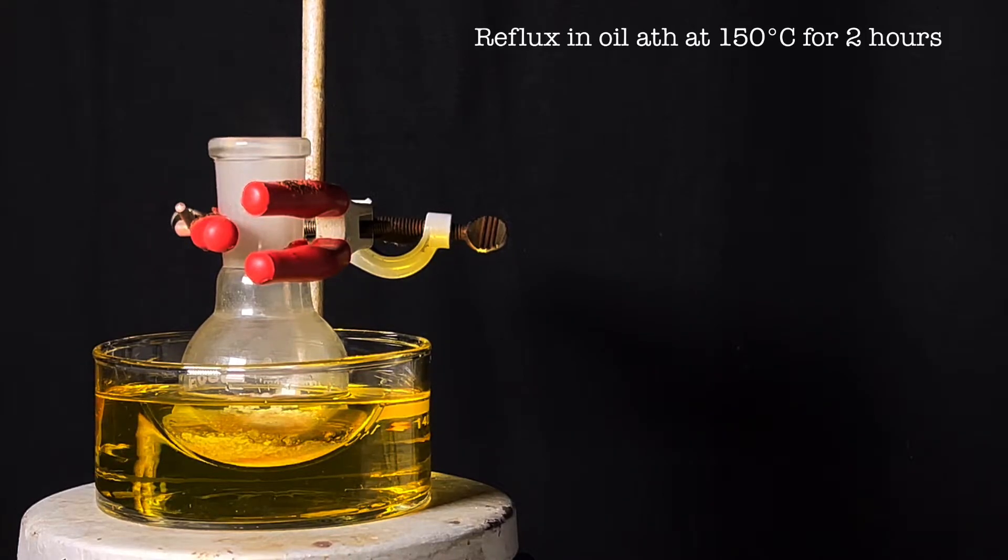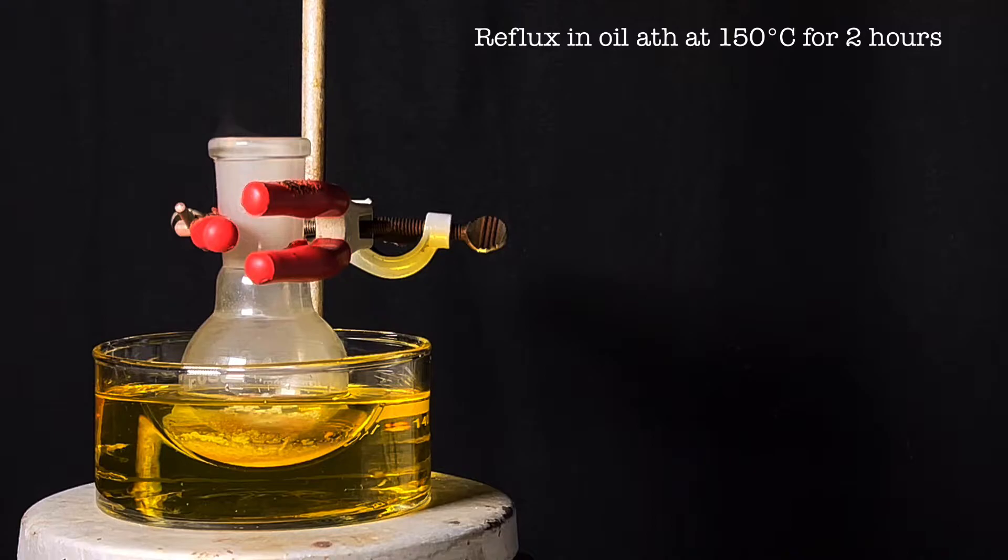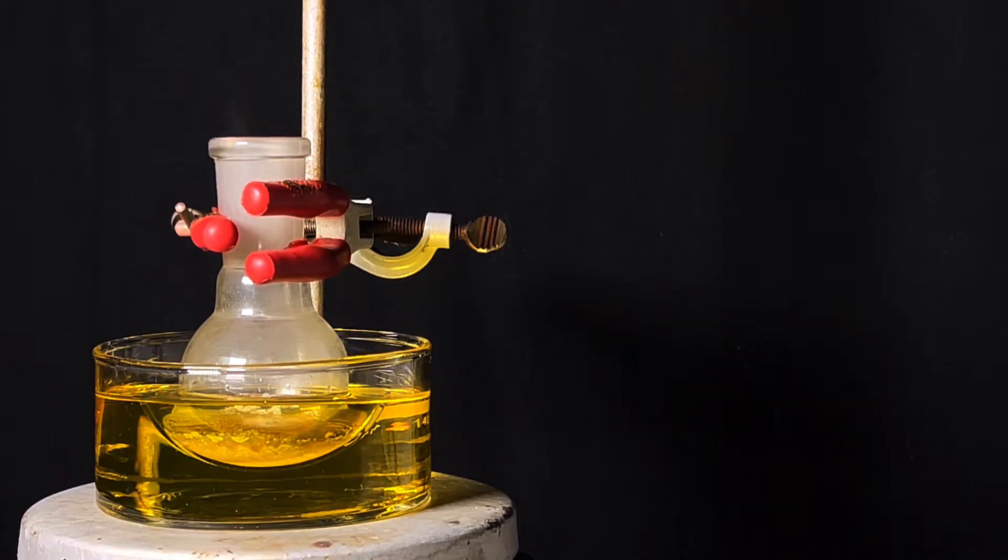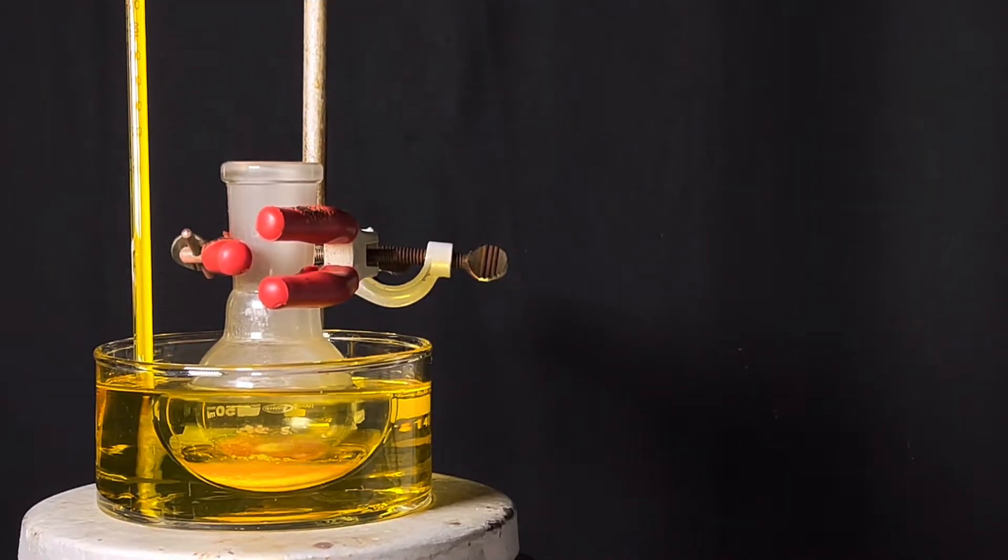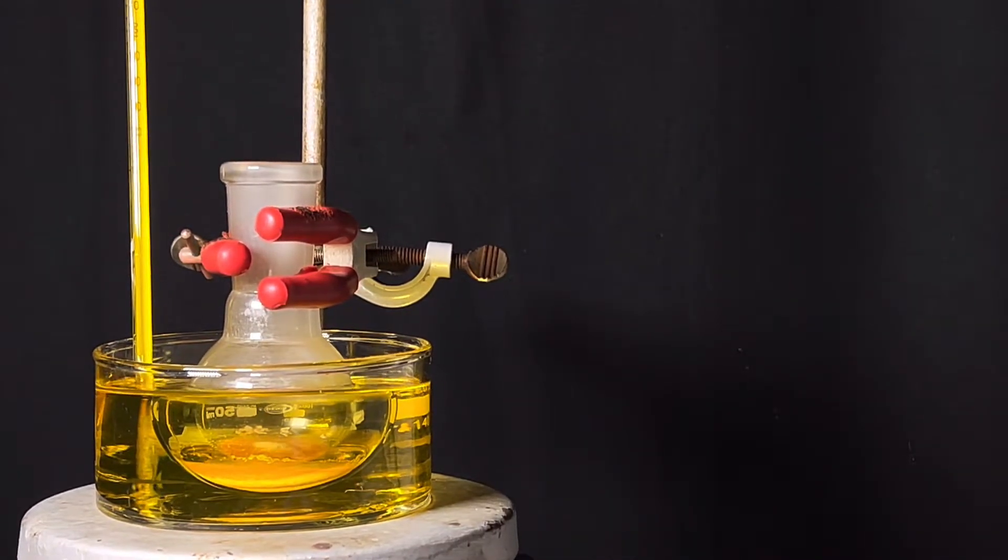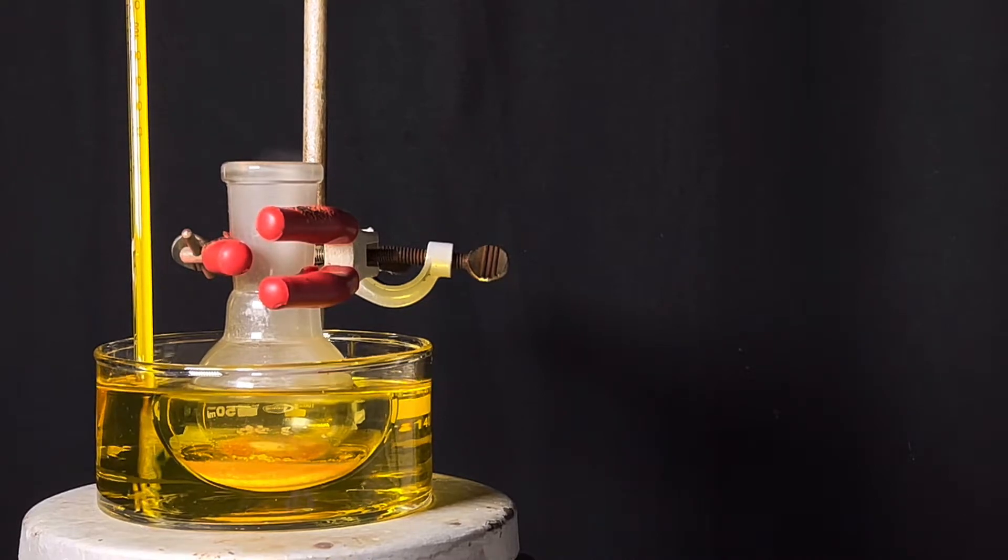Next, the round bottom flask was immersed in an oil bath and heated to 150 degrees Celsius. A small stirring bar was put in the round bottom flask and the mixture was continuously stirred. A thermometer was inserted into the oil bath to monitor the temperature. The mixture was heated for 2 hours.